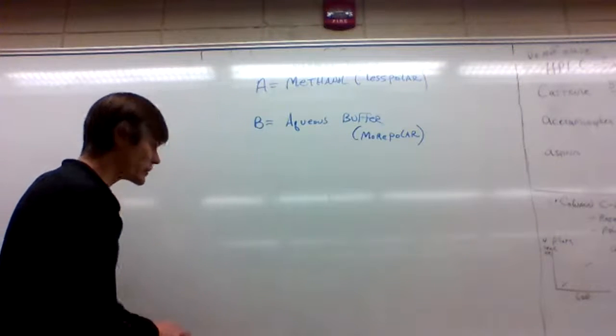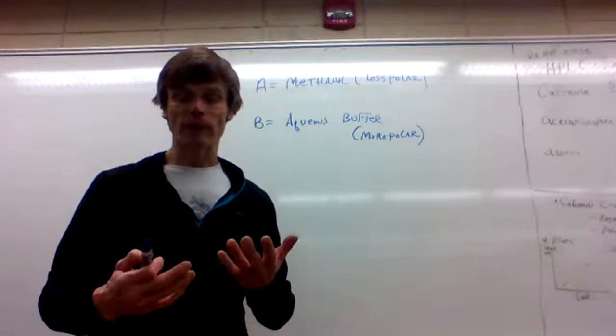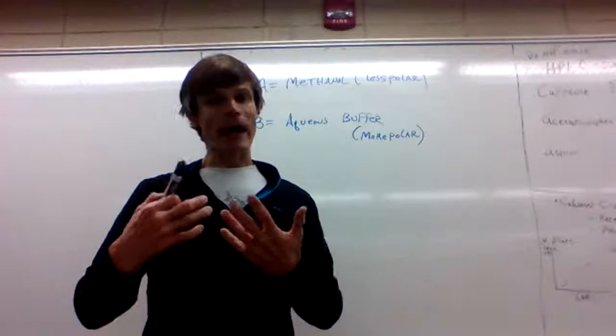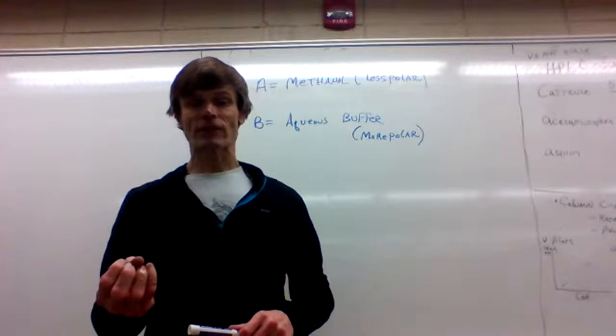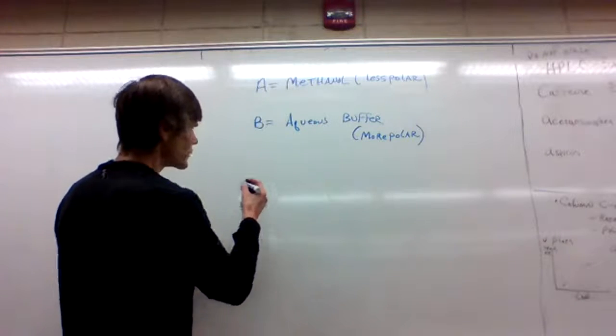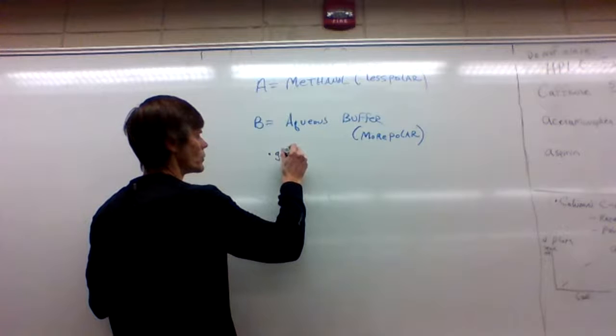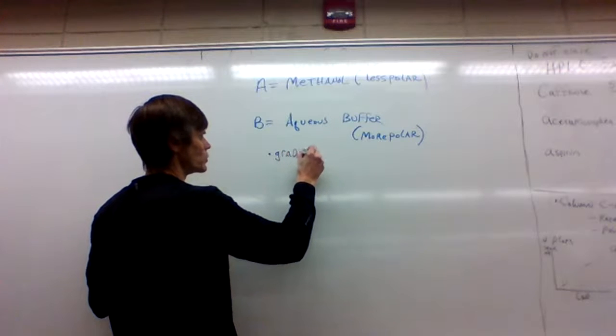Now, one issue that we discussed earlier of improving our analysis, improving efficiency, improving our speed of our analysis for liquid chromatography is to use a gradient elution.